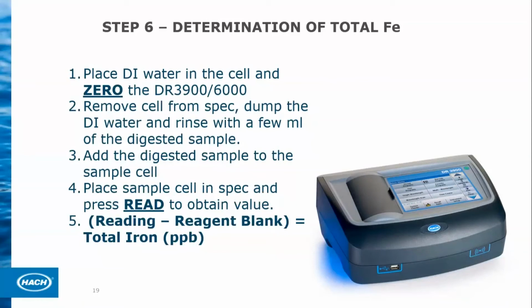The other thing that I want to point out here, which I didn't mention, is that you want to do several samples. I've been doing this for a long time, and I'll usually do 5 or 6 identical samples, and invariably one of those is going to be off scale. I don't know how that happens, but you want to throw out any outlier. So again, we're working with very low ppb levels. It does not take much to contaminate a sample.